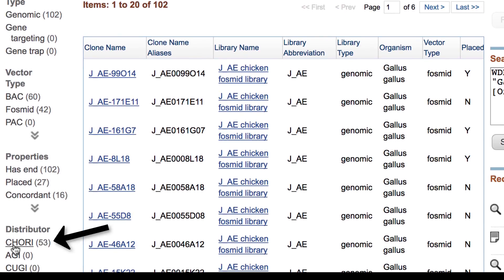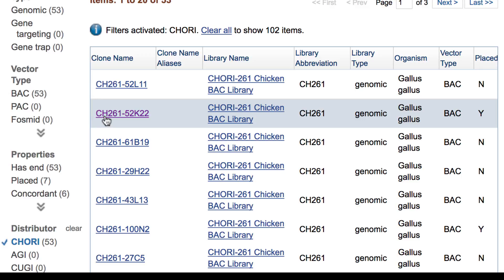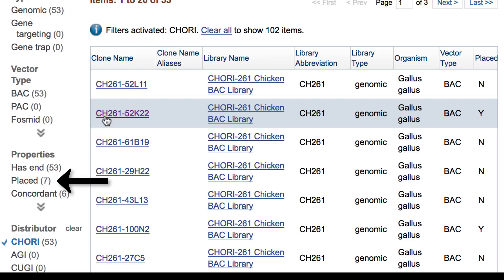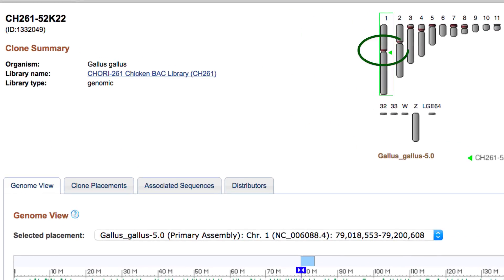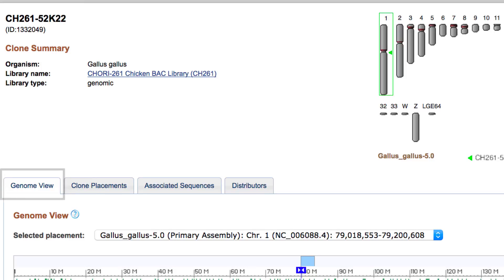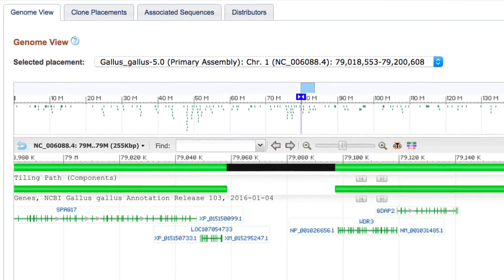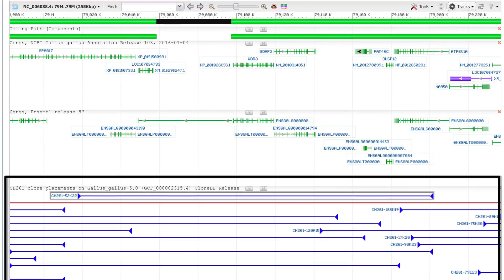Let's filter to clones only from the distributor CHORI. Then select for our example the first clone in the table that is noted as placed, CH261-52K22. Notice that I could have filtered for placed clones. We see an ideogram with the approximate chromosomal location of this clone. Below that are tabs with additional information, but let's focus on the genome view, which shows the selected clone placement in the context of known genes and other placed clones from the CH261 library.